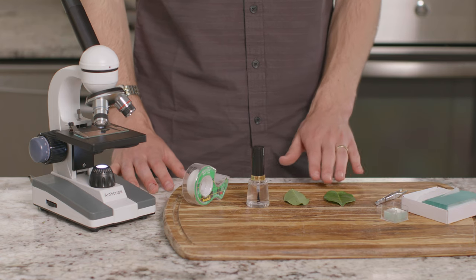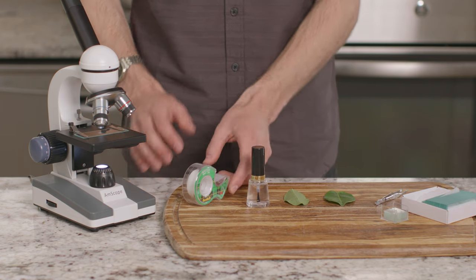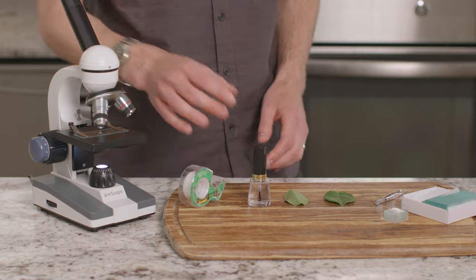For this experiment, we will need a leaf from a live plant, tape, clear nail polish, and a microscope.